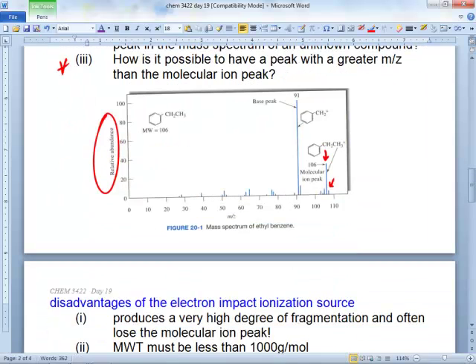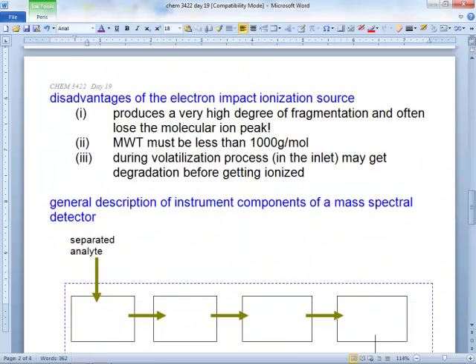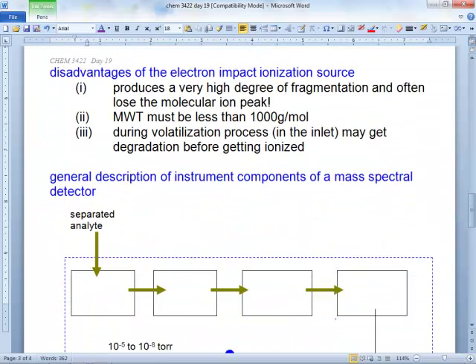Isotopes. So there are some disadvantages. Remember we said that this is what folks want. If you're doing a big research project, like I said, out in the middle of a prairie or something, you're after those ion peaks because your library search isn't going to do you any good. So electron impact ionization may not be the way to go. You might want a different way to ionize.